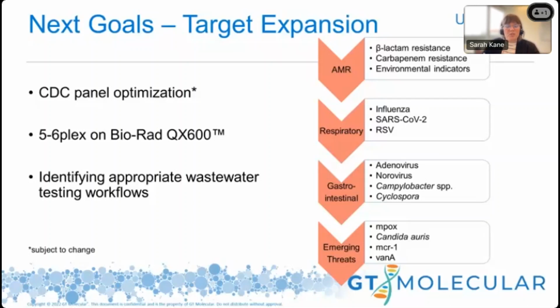Before we start talking about having that readily available, we also have to make sure that we have the appropriate wastewater testing workflows. There are a lot of nuances with different concentration methods and different extraction technologies, making sure that what you choose to do is compatible with all of these targets. I have a couple of people on my team, and I know that the CDC is also working on this, to identify not just assays and formulations for assays, but the actual methods of wastewater testing that users can use in order to monitor this large panel of targets for the next phase of wastewater testing. And just as a caveat, all of these are subject to change.